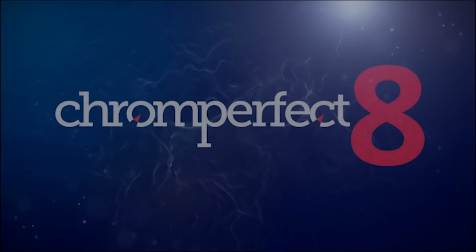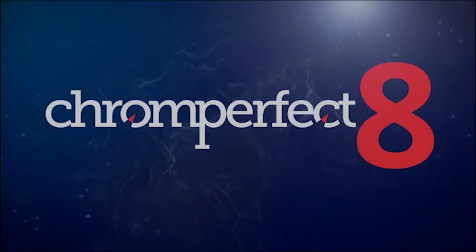Existing Chromperfect customers will need to update their software to version 8.2 or higher to use this new barcode functionality.